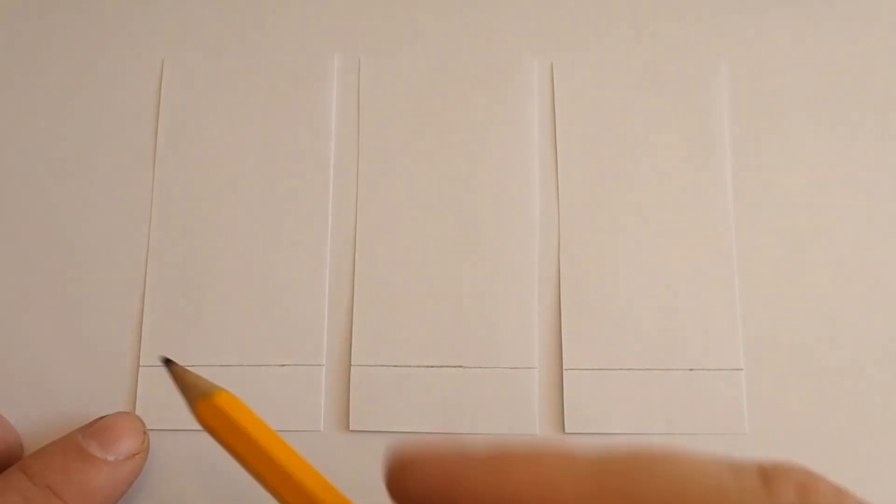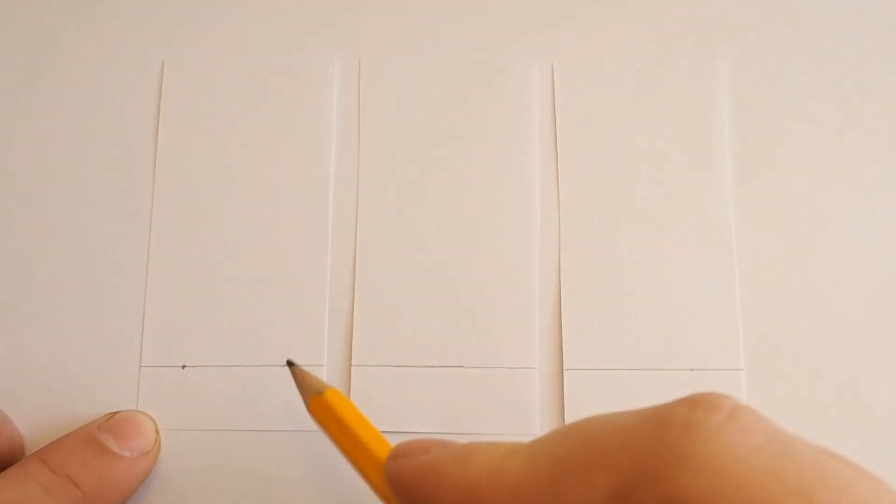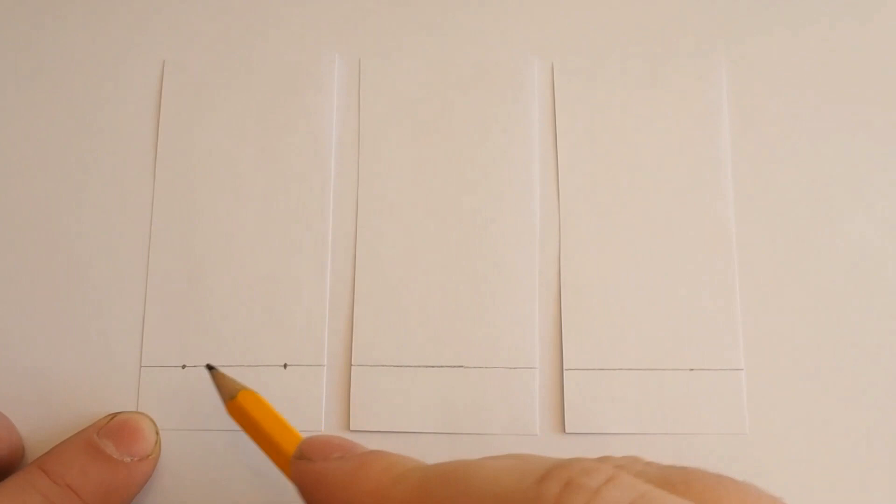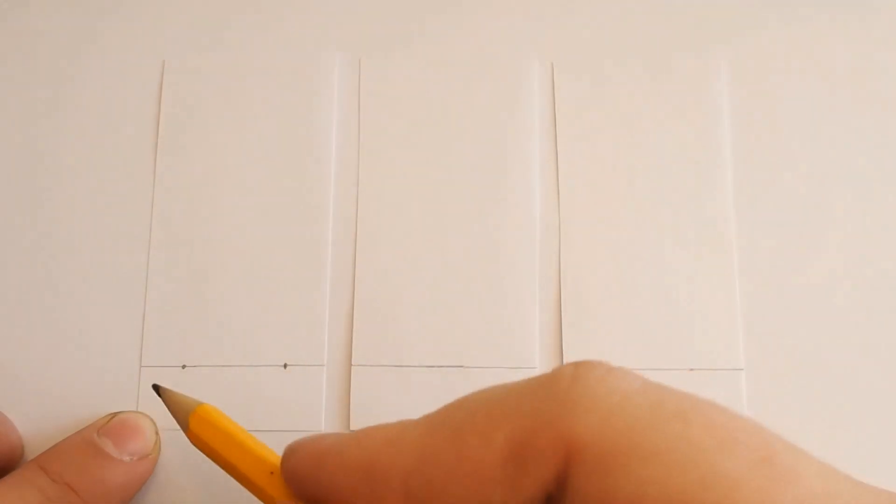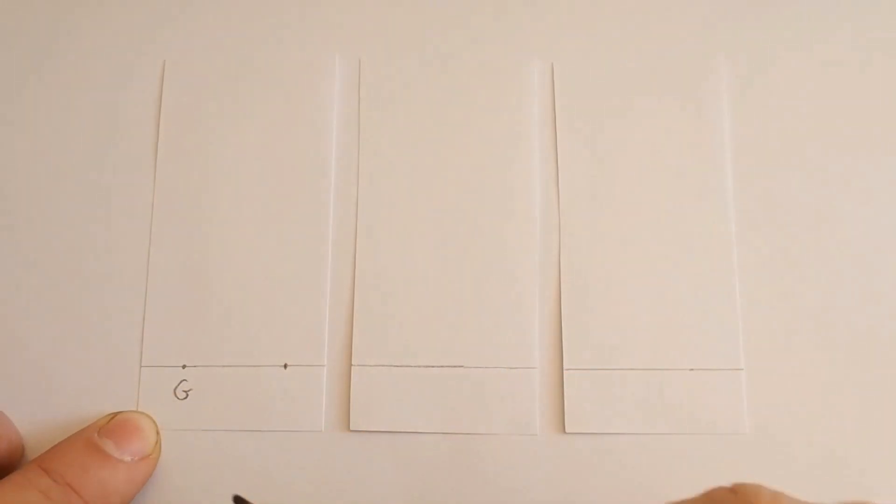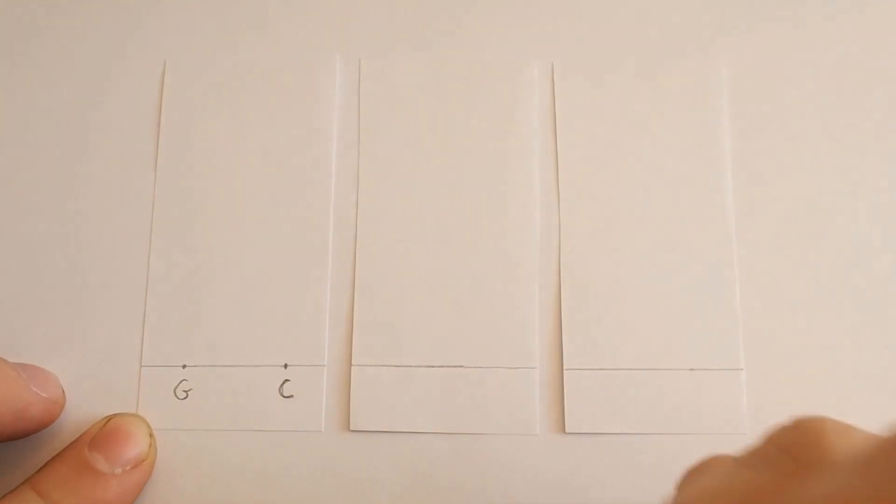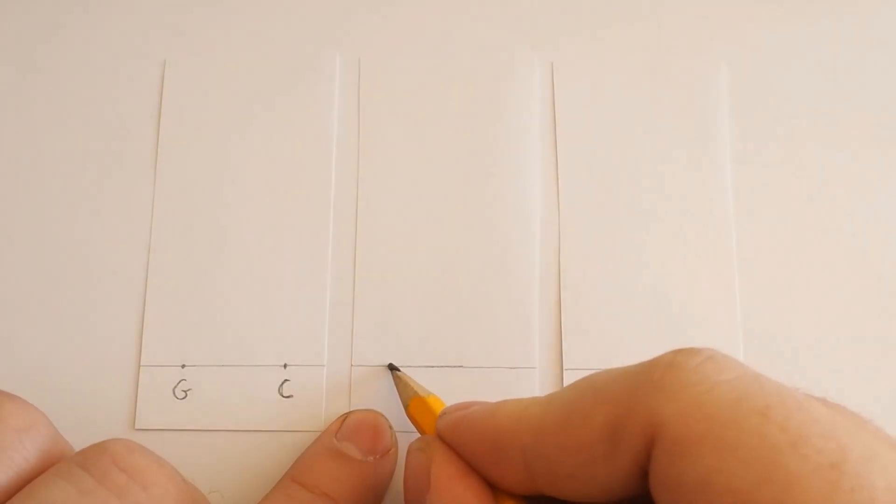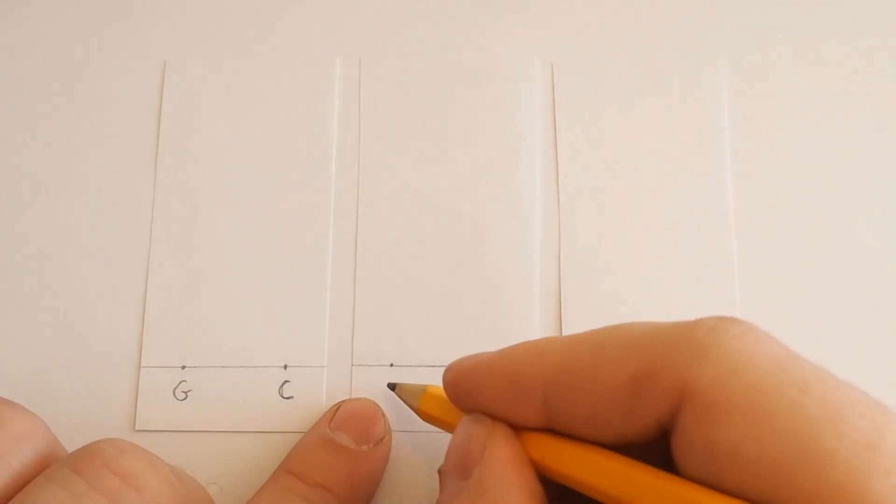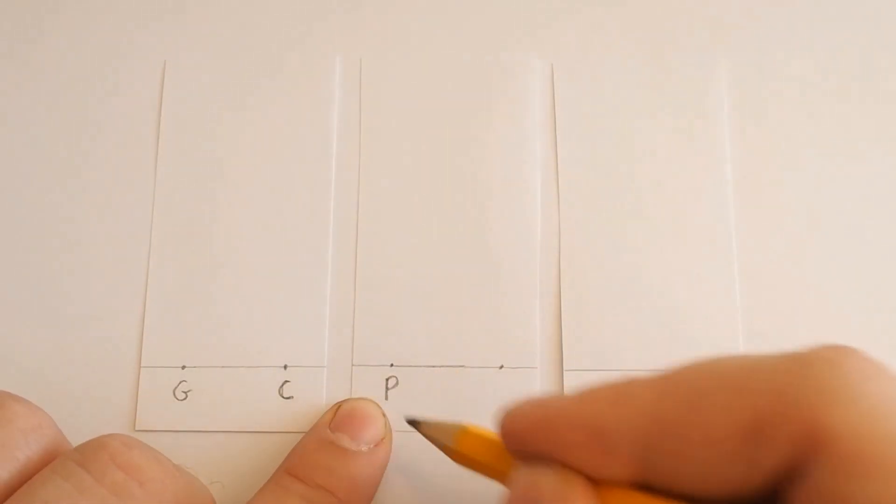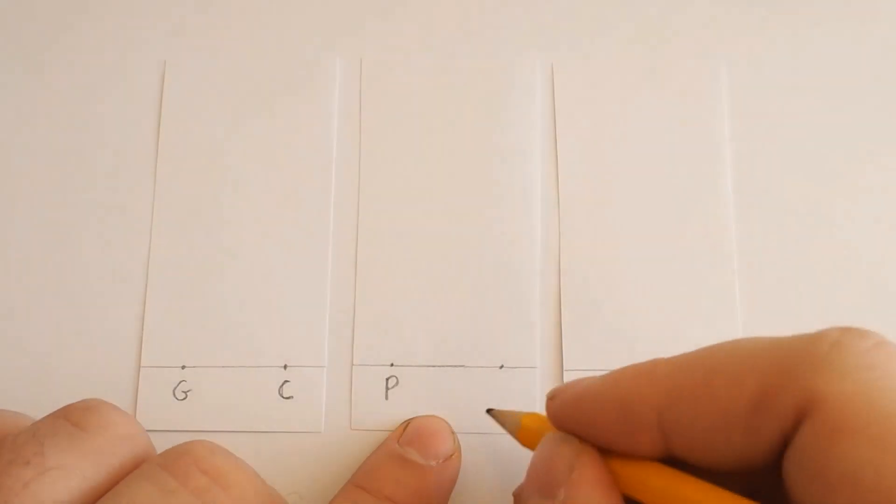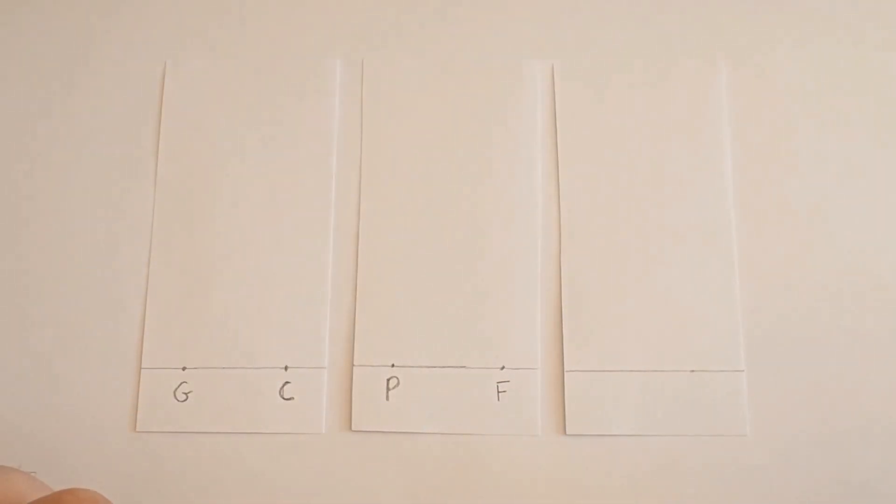We'll see them separate into different molecules and we'll be able to tell what different constituent parts we have in the solution. But first I need to label up. So I'm going to put a little dot here and a little dot here just so I know I'm putting two samples on this one and I'm going to put a G for my grass sample and a C for my camellia sample. And on this one I'm going to put a P for my pulmonaria sample and an F for the forsythia sample.